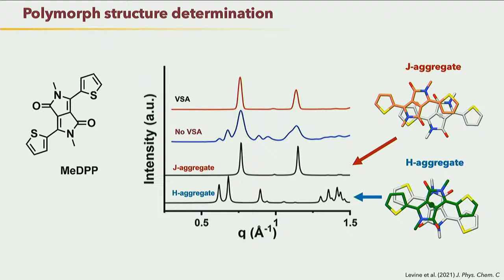I know small molecule crystallographers do that as well, because you want to make sure that when you recrystallize it, it is still what's represented in the bulk. But I think people forget about it for MicroED because you think, oh, well, it's the same sample. I just put powder on, so it is the same sample, but not always. You could get lucky and catch that one crystal that's different than all the others. So that's my speech on why you should couple it with other methods.